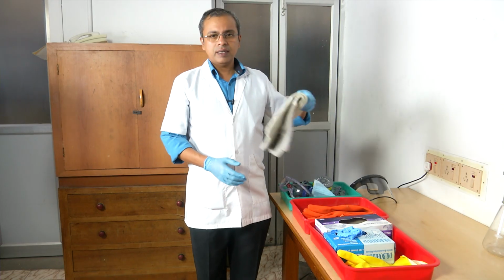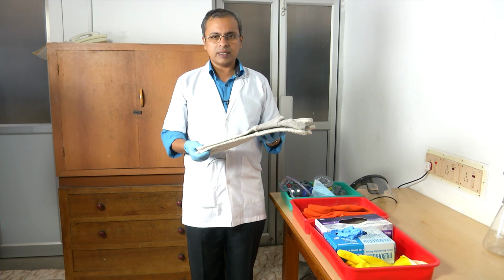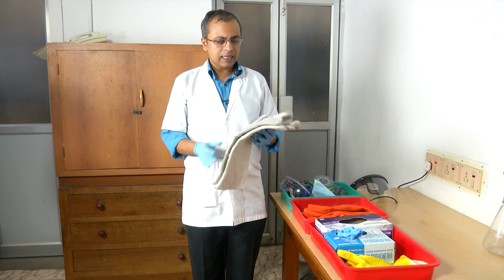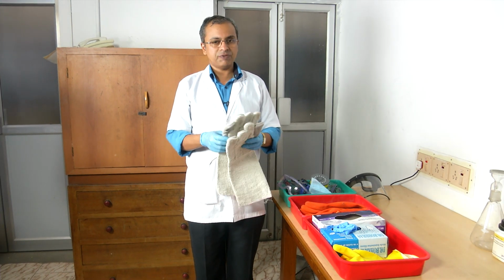As part of safety associated with thermal things that we do in a lab, perhaps the most important thing is handling hot items, equipment that may be hot or samples that may be hot. Straightforward thermal capability gloves are there which can handle a fair bit of heat and protect your hands from the heat.